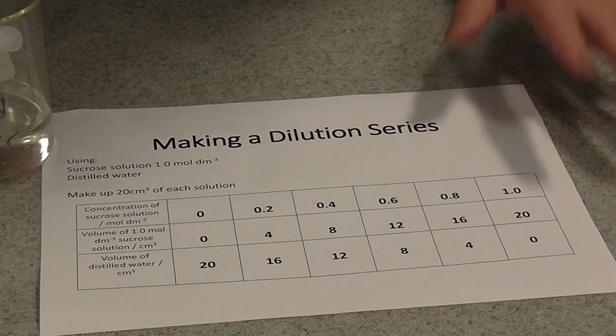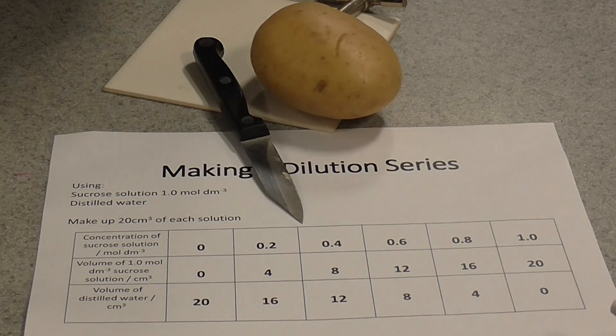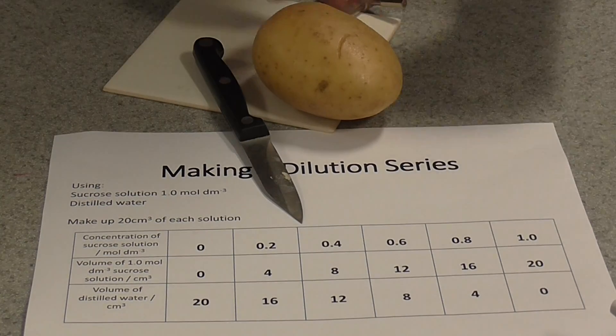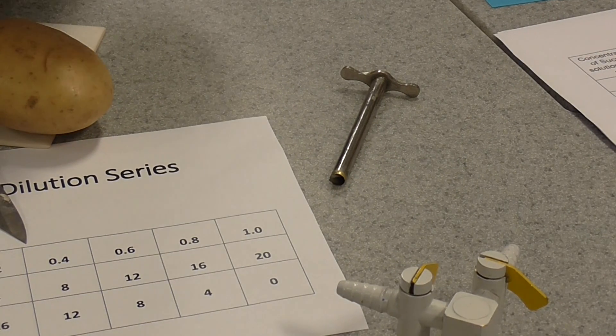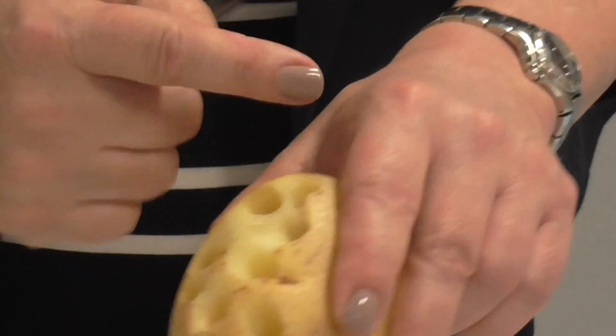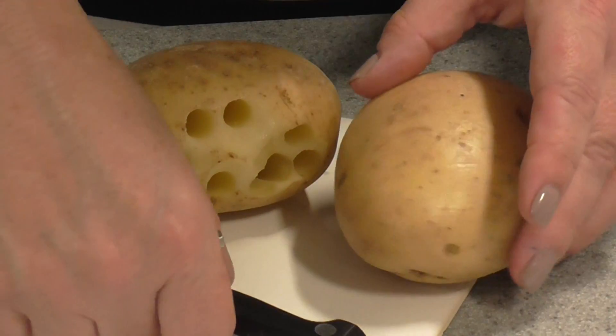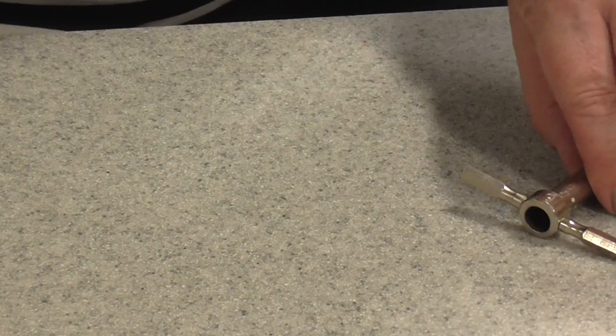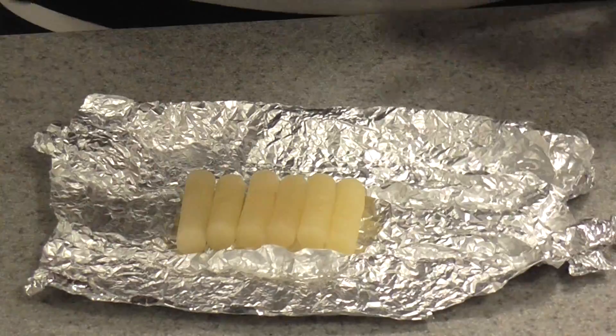Now while they are equilibrating, we're going to prepare some small chips of potato. The best way to do this is to use a number six cork borer, and we can cut little cylinders of potato tissue. You can use a chipper if you like - a chipper's better if you're making a large number for a large class. Make yourself some little cylinders of plant tissue and cut them all to a very similar size. I've already prepared these earlier and wrapped them in foil so they don't dry out. There they are, that's what they should look like.